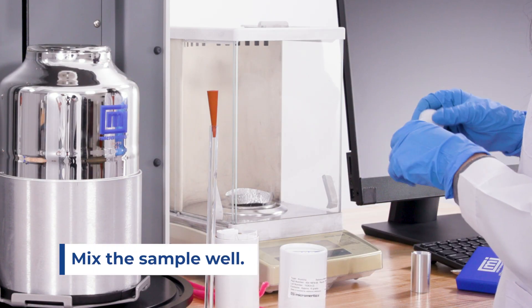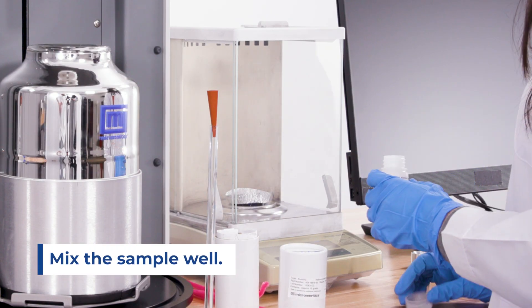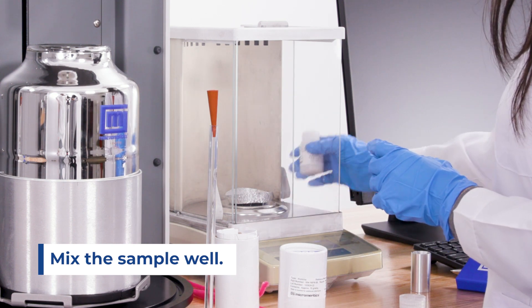Tip number three: sample preparation. When preparing the sample, ensure to obtain a good representation of the batch by mixing the sample well.